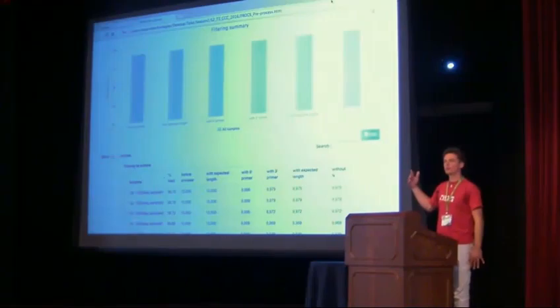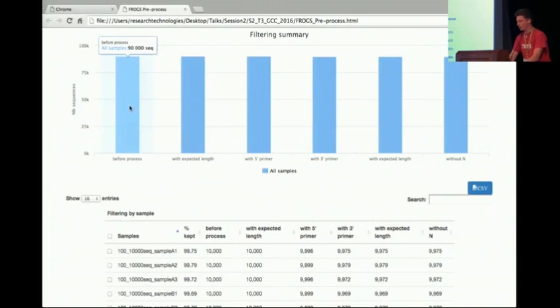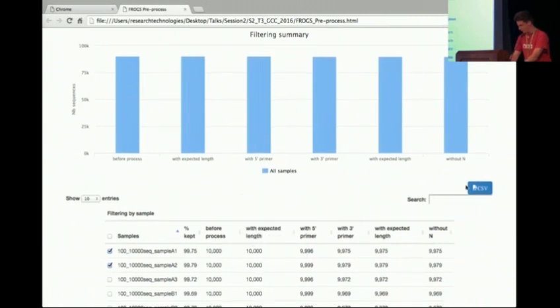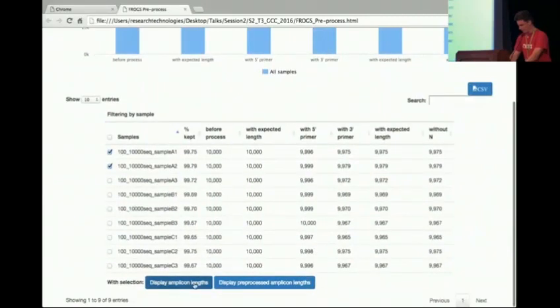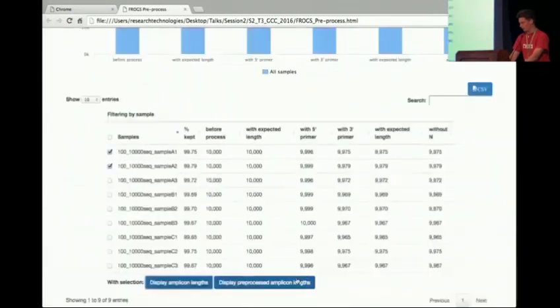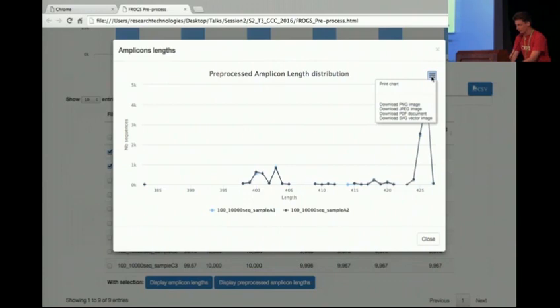So for example, you have this kind of report generated by FROGS. This is something quite interesting and beautiful for biologists. You can see the samples you have before processing, after processing, and after applying different filtering steps. You can export in CSV, and you can select some samples. You can also display amplicon lengths before and after preprocessing, and you can choose to download the charts in the format you want.